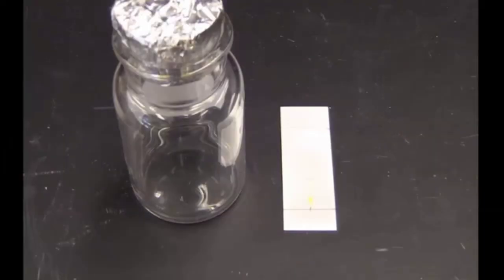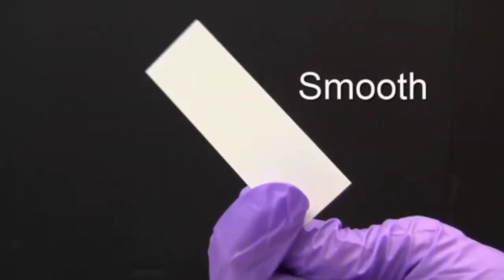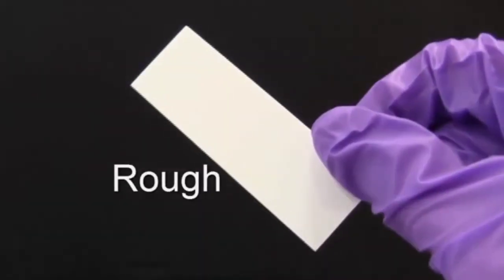This technique allows us to separate the different components of a mixture. For this experiment, we will use a TLC plate, a sample, and a solvent. The TLC plate has two sides. Be sure to use the rough side, which is coated in silica, for the experiment.